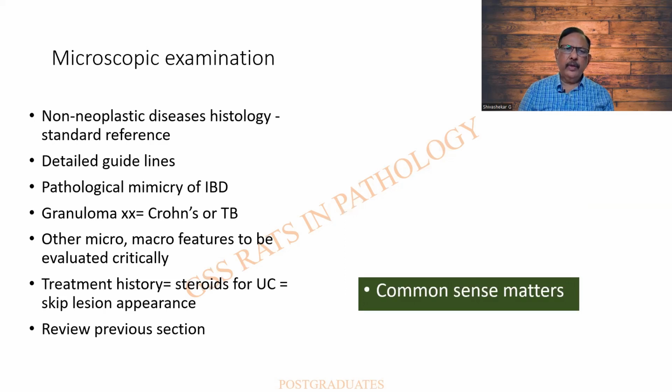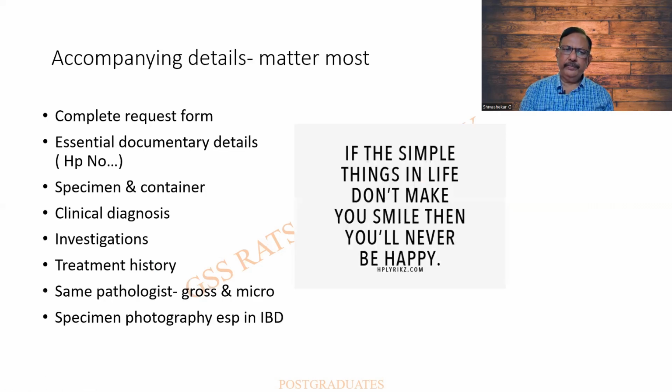And other micro and macro features must be examined critically. Treatment history: steroids in the case of ulcerative colitis, and any previous treatment should also be borne in mind. So these are the things which we had mentioned earlier: the gross and the microscopy and the other details.